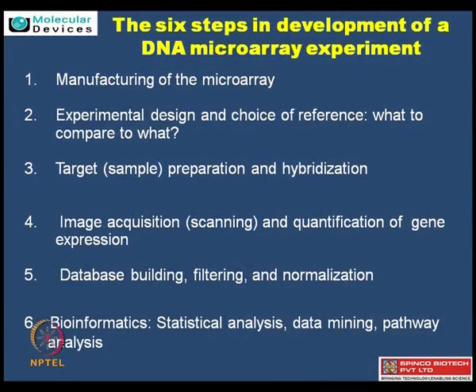I think it will be useful if you can first give some steps for the DNA microarray experiments. Although this is a proteomics course and I have been talking more about protein microarrays, this whole technology got initiated from the DNA microarrays. So just so that students have some idea about how the DNA microarrays are performed, just give some brief steps about the overall DNA microarray technology, and also how and what GenePix can help in the microarray process.